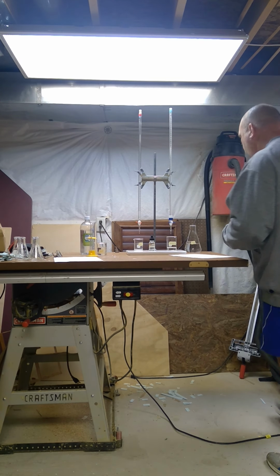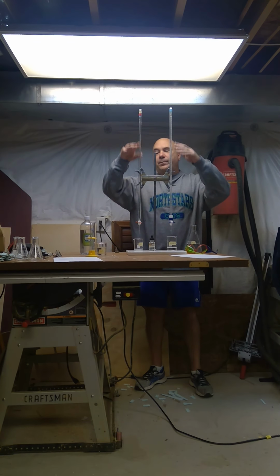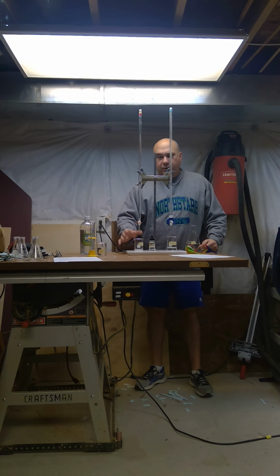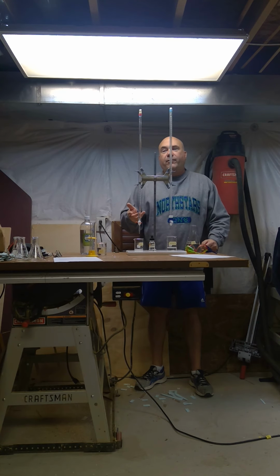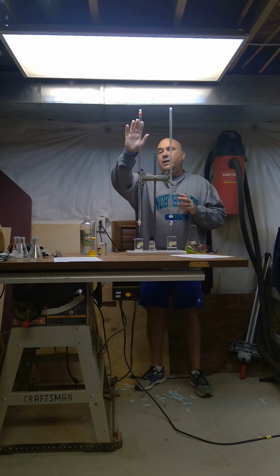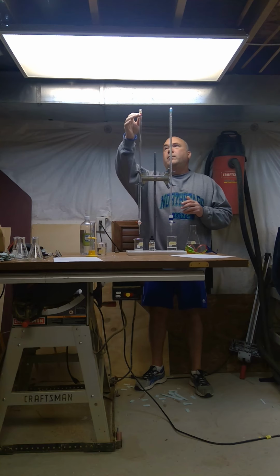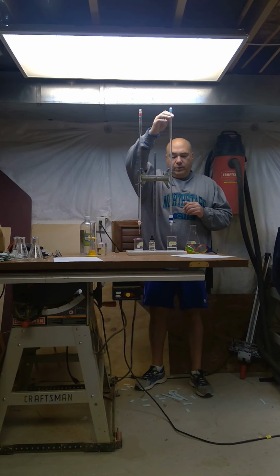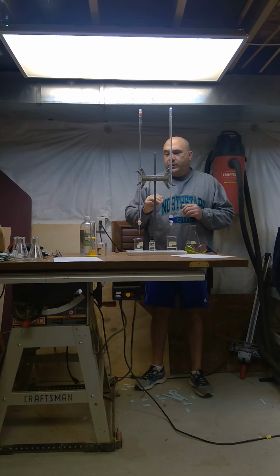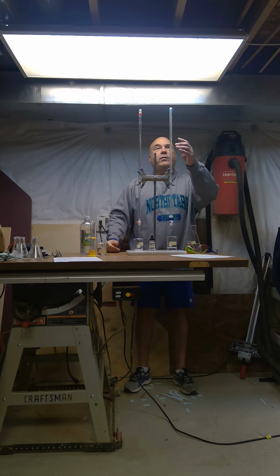Now, I want to go over a couple things just so you kind of remember. So these are called burettes, and I've already done the first bunch of steps in the lab for us. Okay, so the first steps were to set up the burettes. Now on your left side, this is the vinegar side. Red means acid. This is the blue side. This is the base side. Right. So our analyte, what we're analyzing, is the vinegar. Our titrant is 0.10 molar sodium hydroxide.